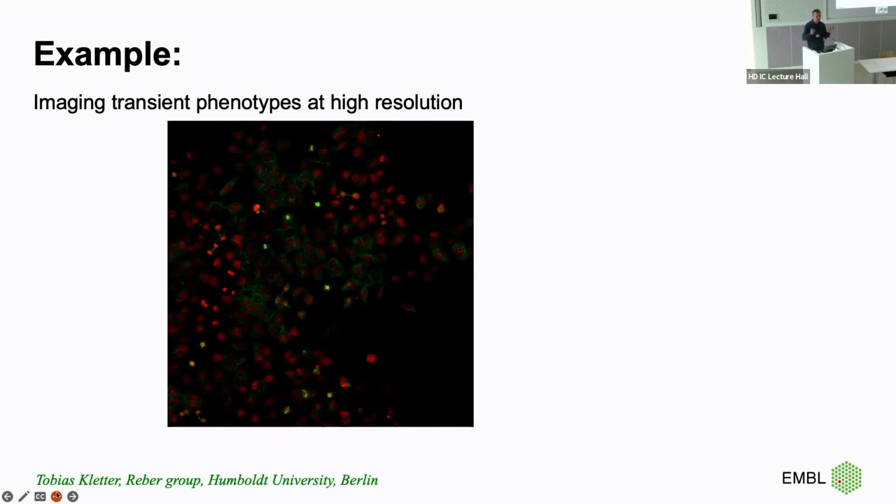So when you're, for example, on a confocal microscope and you want to get a fast, high resolution picture, if you're on the point scanning confocal, you want to find your phenotypes, go to define these positions and trigger the acquisition in the simplest case, right? So I start with the example which became a textbook example over the last years. If we are interested in metaphase cells, we need to identify them, and we can, for example, grab a low resolution image with a decent resolution just to identify the cells.